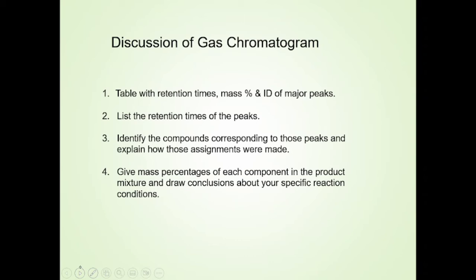And the other peaks, you don't need to identify them. For the aldehyde and triphenylphosphine oxide, if you identify those, you can simply state peak at 4.2 minutes, whatever the retention time is, had a mass of 140, which equals the mass of chlorobenzaldehyde, and no further mention is needed for that.